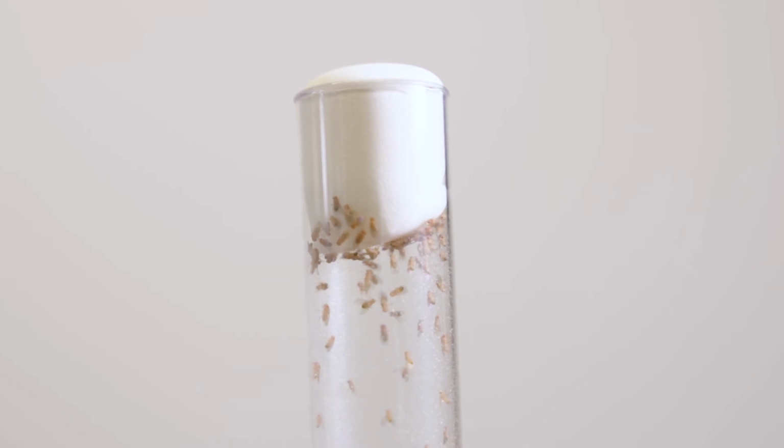The fly is great, I think that's clear. With contributions to research for over 100 years, Drosophila has the advantage of advanced genetic tools. Today we have learned that the fly can be used to study many diseases, but here at our institute, the focus is of course cancer research.